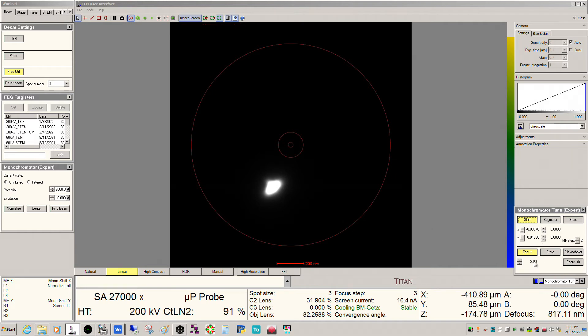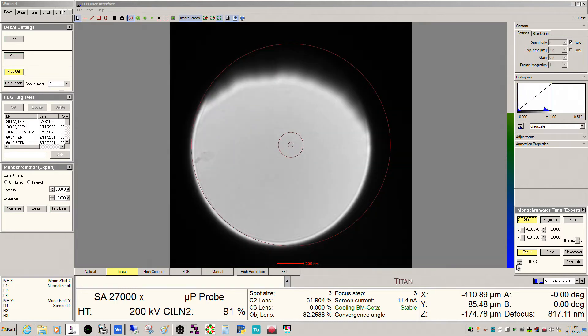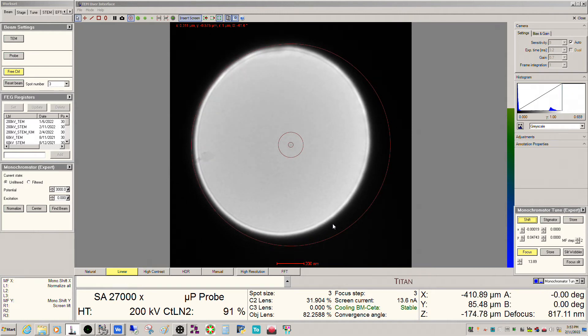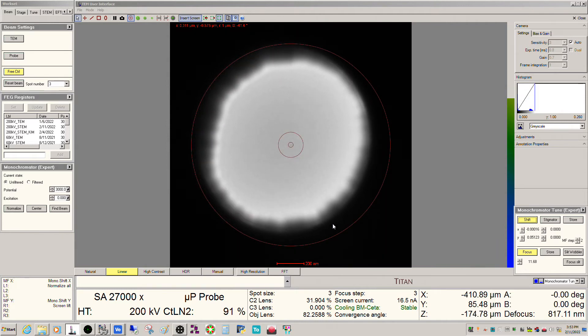So obviously this isn't really useful for imaging — we have to defocus it. We can go either positive or negative. If you're going to do STEM, it's better to go on the positive side. When I spread the beam out, you can see I'm not centered inside the C2 aperture. This is where your monochromator shifts come into play — basically barely adjust it until you can see the edges sit inside the aperture, and then you can spread it out as much as you want.